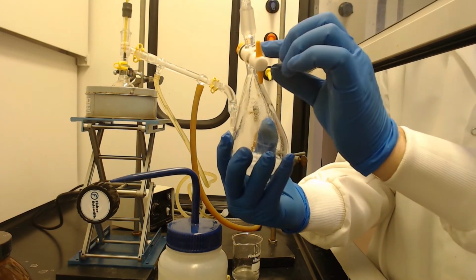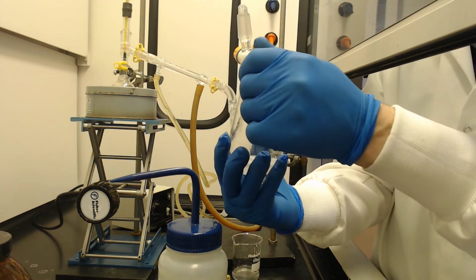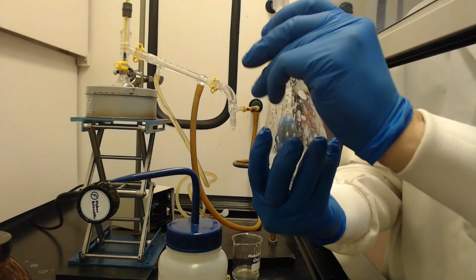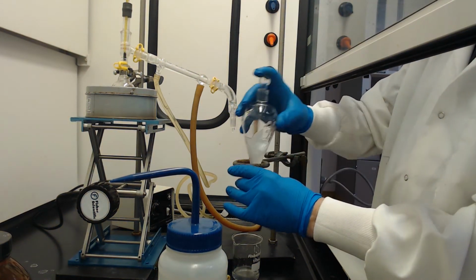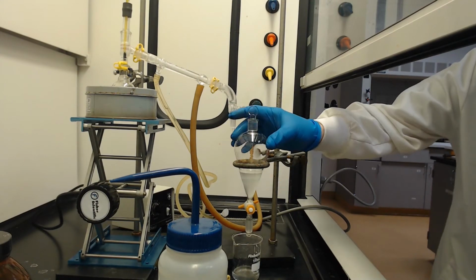And when I do vent it, I can see a little bit of liquid there, and so I can see a little bit coming up. Get it nice and mixed up, vent it one more time. We'll put it right here and we'll let it rest for a little bit so the layers can separate. So you can see there's a little bit of emulsion here. It's disappearing pretty quickly.